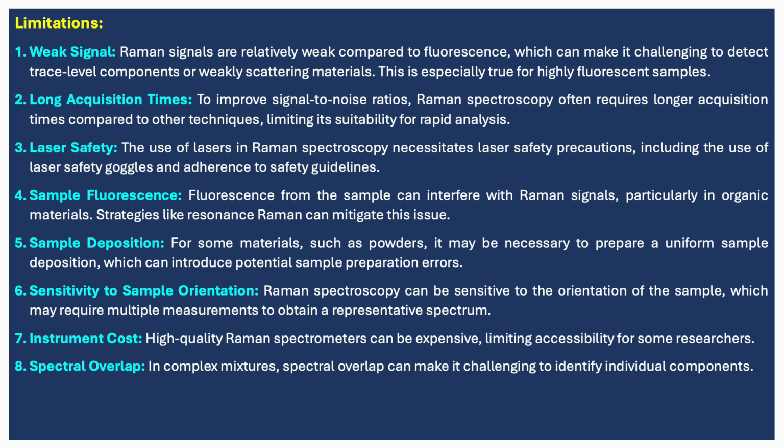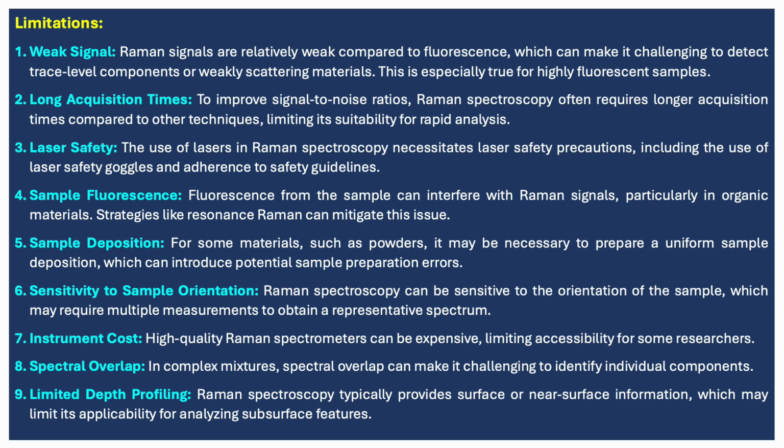In complex mixtures, spectral overlap can make it challenging to identify individual components of a particular substance. And lastly, Raman spectroscopy typically provides surface or near surface information, which may limit its applicability for analyzing subsurface features.